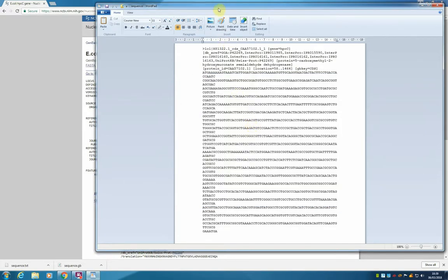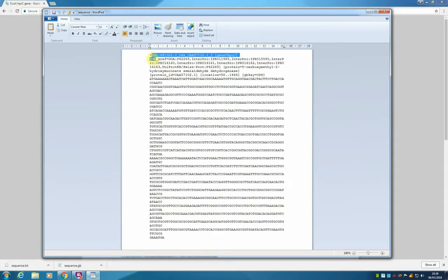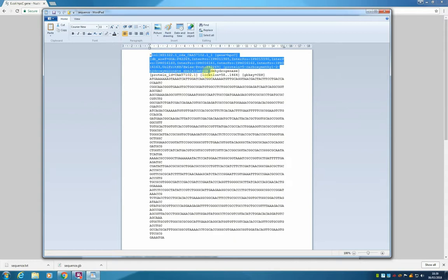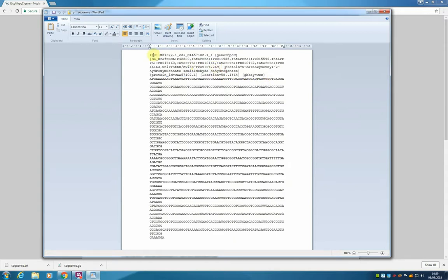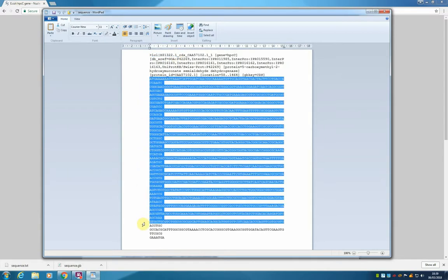And this is the FASTA sequence. The first line has a more than symbol, followed by the name of the entry, which is quite long in this case. It could be just as small as the accession number. And then, all the sequence that follows.